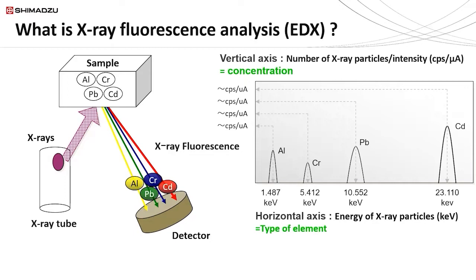So what you can do is use an energy discriminating detector, like a silicon drift detector, to obtain an energy dispersed X-ray fluorescence spectrum, which you see pictured here in a cartoon on the right. In an energy dispersive X-ray fluorescence spectrum, on the horizontal axis you have photon energy, or X-ray fluorescent energy, which is normally denominated in units of kiloelectron volts.